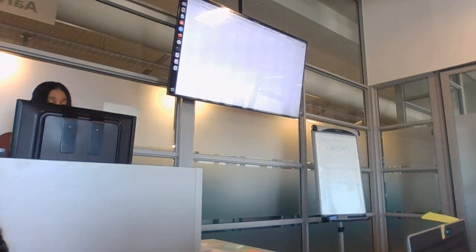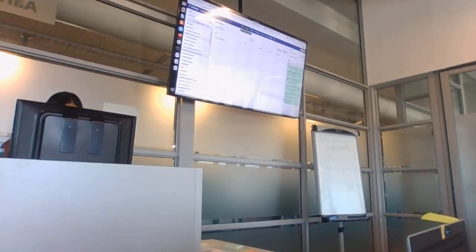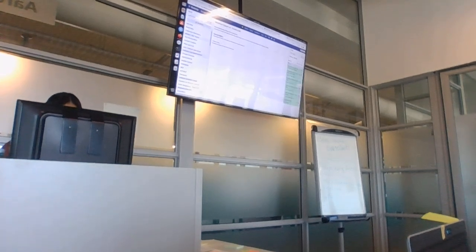You click on the, just trying to go back. You click on the workflow, and then you click on export. So you go to workflow, you find the workflow, you click on export, and then you can download the workflow, create an image, you can download it.